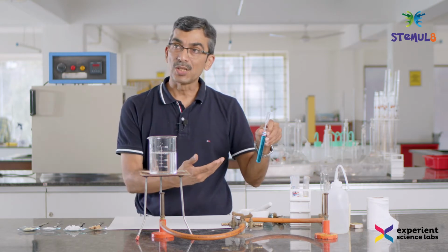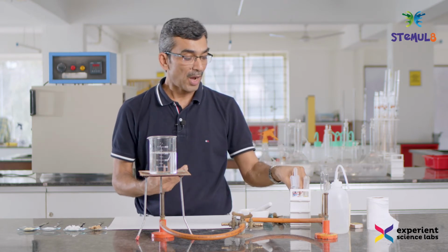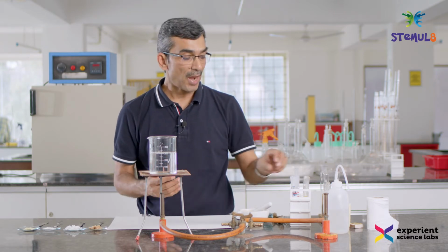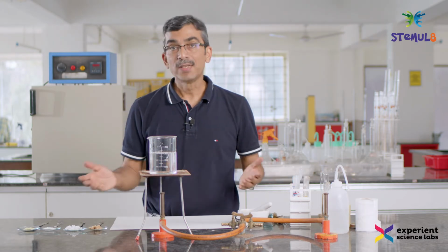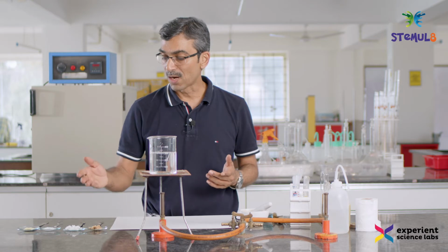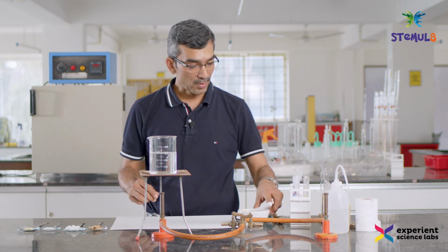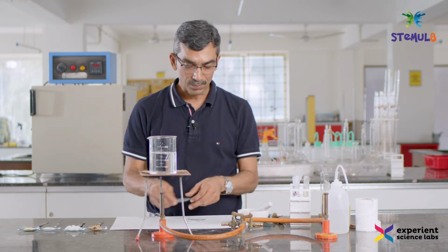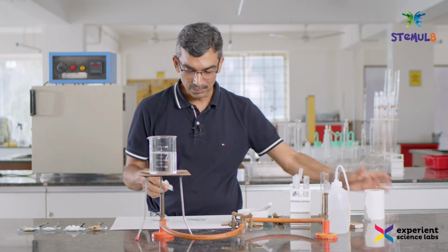Now Benedict reagent is used for identifying the presence of sugar. Iodine, as you know, is used for identifying starch, and biuret is used for identifying protein. So let's start the testing. I will start with the testing of starch, and I will start with rice and sugar. So I will take two observation glasses and wipe them clean.